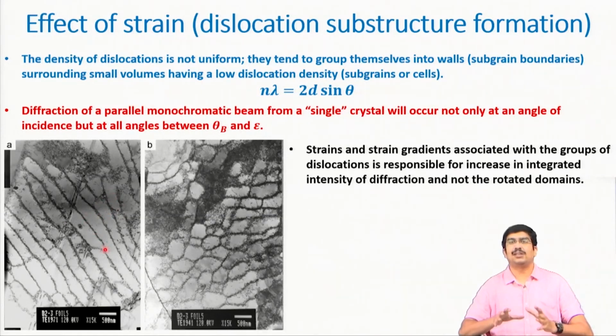That means the dislocation density or dislocation distribution becomes very non-uniform in those kind of materials, and the size of this, as I said, this is called a cell structure, dislocation cell structure, and this also evolves basically as a function of applied strain. The dislocation structure also evolves. Initially you have this band like structure, and then you have the cell like structure, dislocation cell.